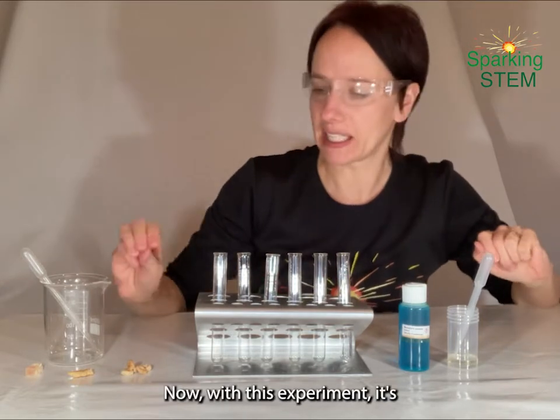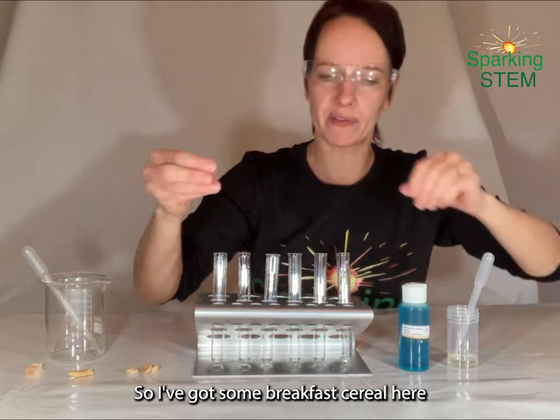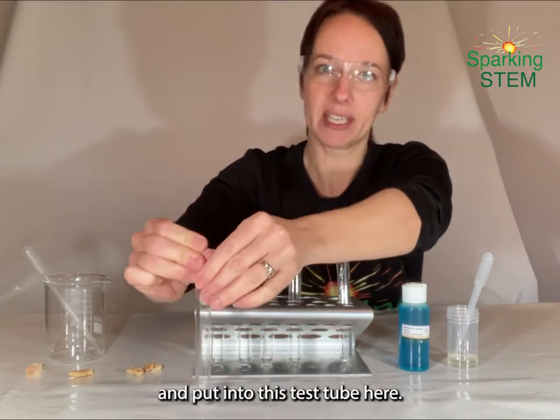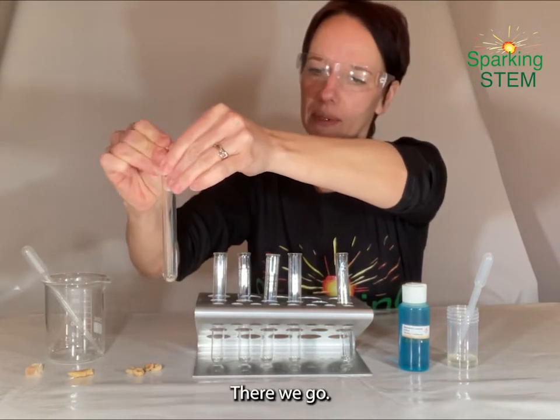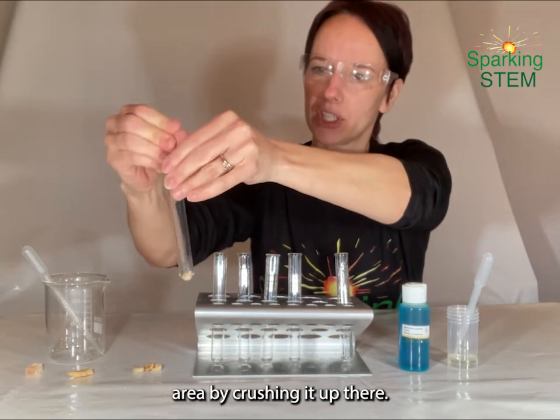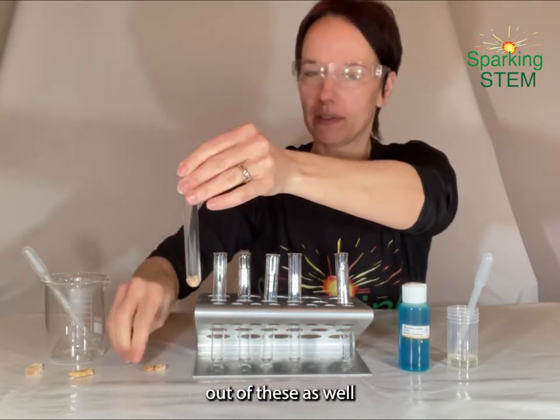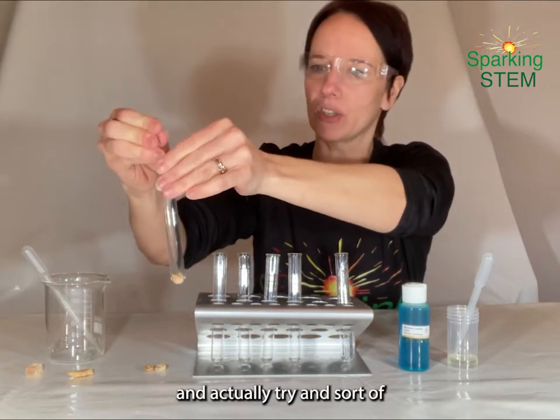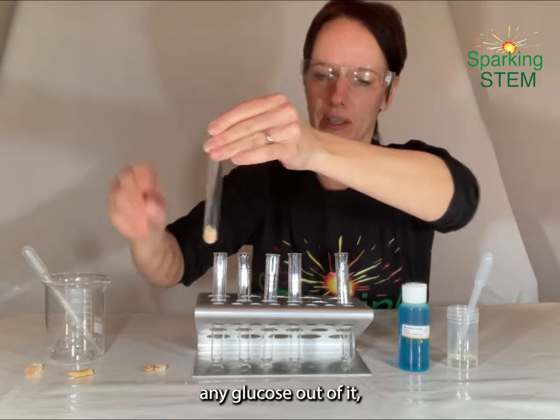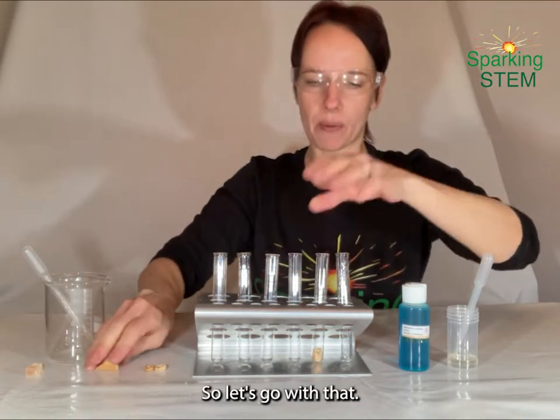With this experiment, it's always fun to try some real food. So I've got some breakfast cereal here, which I'm going to crush up and put into this test tube here. Increasing the surface area by crushing it up there. Ideally, you would create a solution out of these as well and actually try and get it into a liquid form and extract any glucose out of it. But it will do the job as a solid as well.